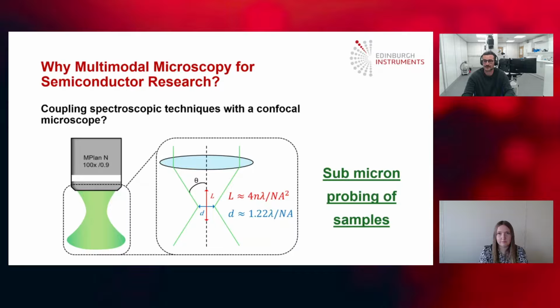So when you focus the Raman or PL laser through an objective and collect the resulting emissions through a confocal pinhole, you have virtually diffraction limited imaging capabilities, so submicron. So we can couple this spatial resolution with the high chemical and structural specificities of Raman and PL, and then we can correlate structure and performance of semiconductor features in 2 or 3 dimensions at the submicron level.